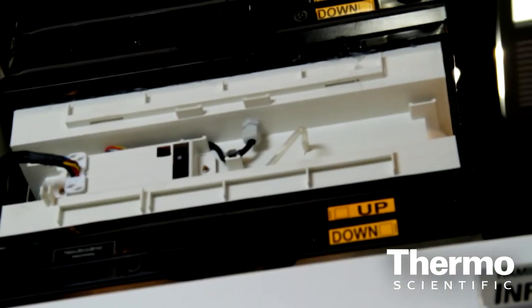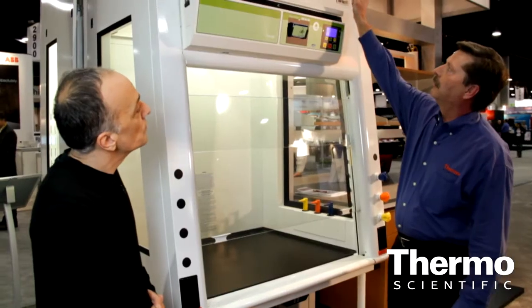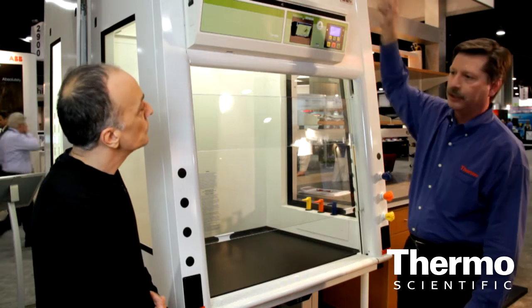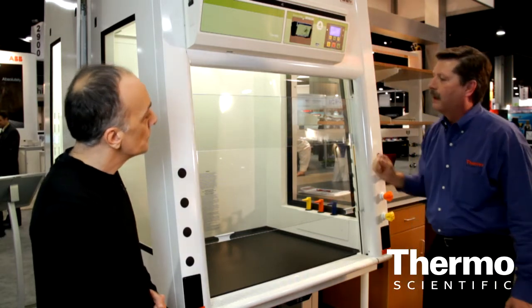This is carbon-based with a patented process called absorption with the Neutradine filters. You have a primary filter, and you've got an exhaust manifold with the fans in it — the exhaust fans — and it's recirculated back into the lab.